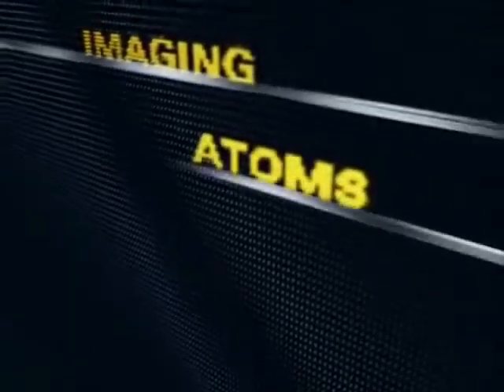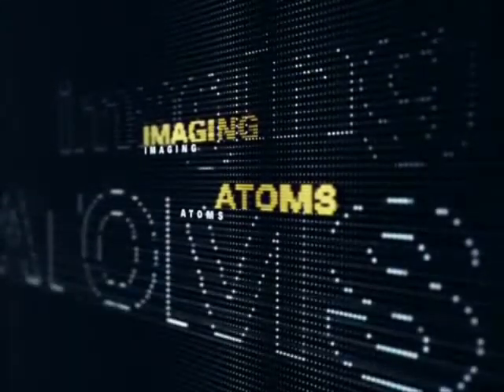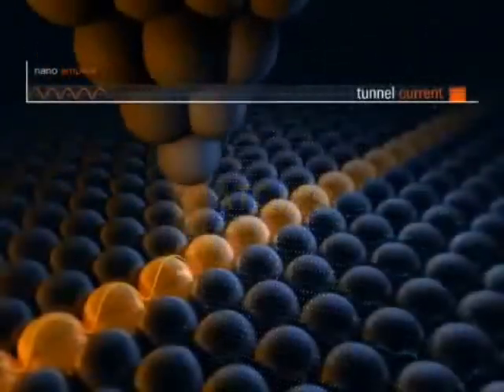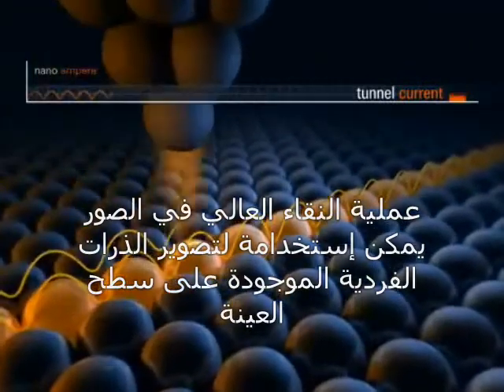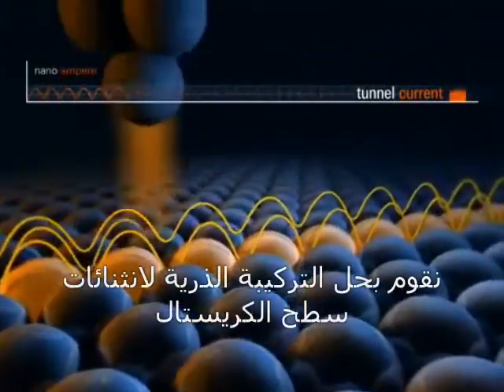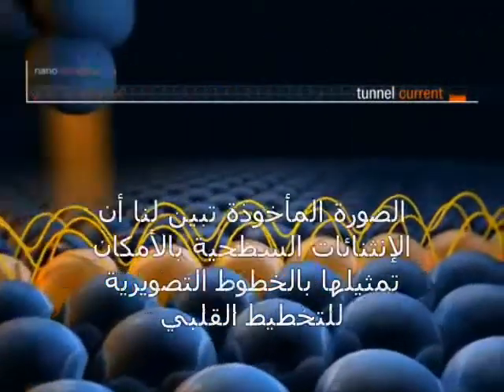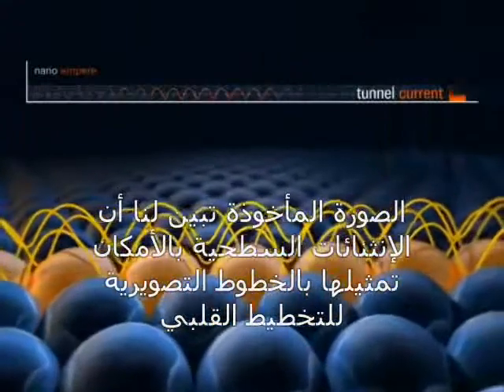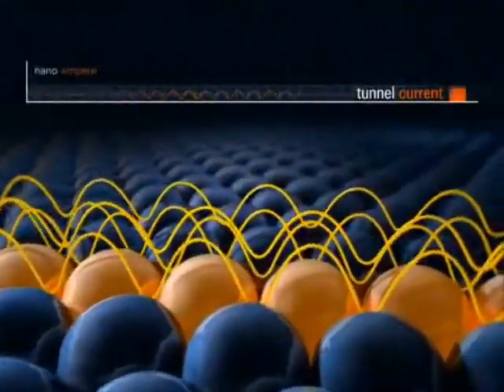Imaging atoms. The high resolution can be used to image individual atoms in the surface plane of the sample. We resolve the atomic structure of a copper crystal. Our images reveal that the copper surface can be modeled as a close-packed arrangement of hard spheres, which are spaced at a distance of 0.22 nanometers.